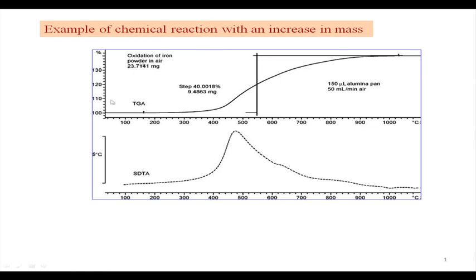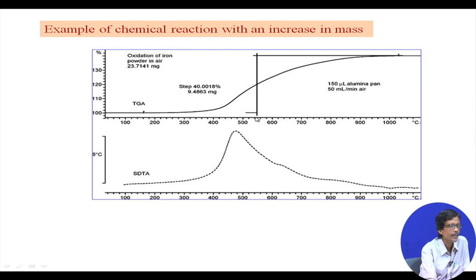So, this 4th place of decimal will immediately tell us that if we heat the sample at say 550 degrees centigrade or 600 degrees centigrade or 700 degrees centigrade, we have a continuous mass gain for this particular sample, which is complete around say 950 degrees centigrade. So, at 950 degrees centigrade we have a corresponding weight gain which is almost 140%.